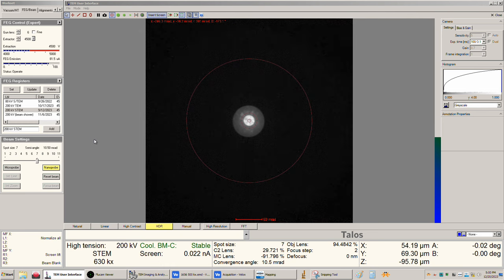You can't hear this, but when I go to 630, this is like the highest mag range. Or is there actually a? No, I think there's. Hold on a second. Okay, so there's one there. There's one at 630, and then there's one at 2.55 MX, and then there's one there too. So I guess it doesn't matter in particular. All right, we'll leave it at 630 here. That's fine.